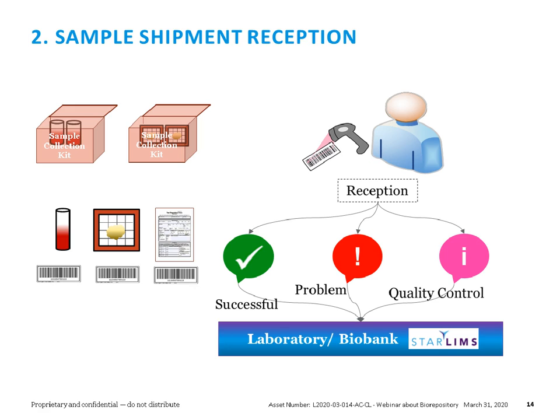And this quality control data, the way we have it, at least in the STARLIMS, is you can configure all the list of reasons or issues that it could be for quality control, such as the sample could be leaking, or is lipemic or hemolyzed, etc. And you can have all of these quality control as a list of options, so then the user can check, okay, this is the quality control issues that we have received on this sample.